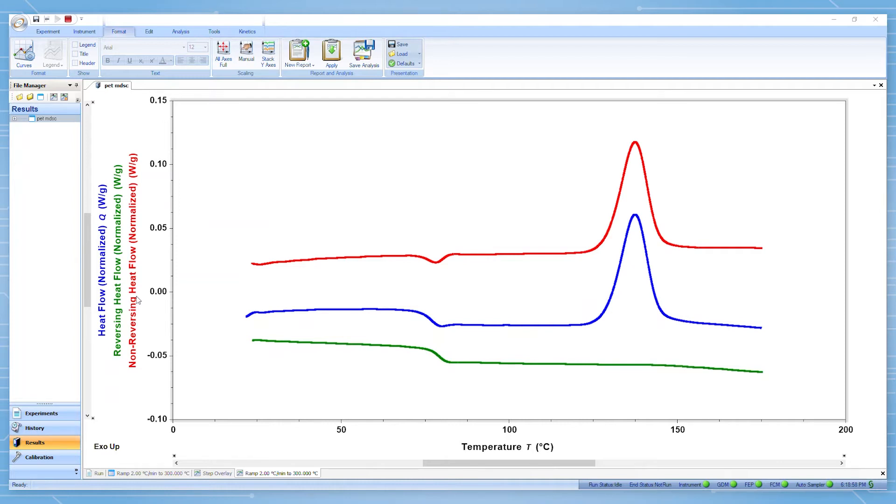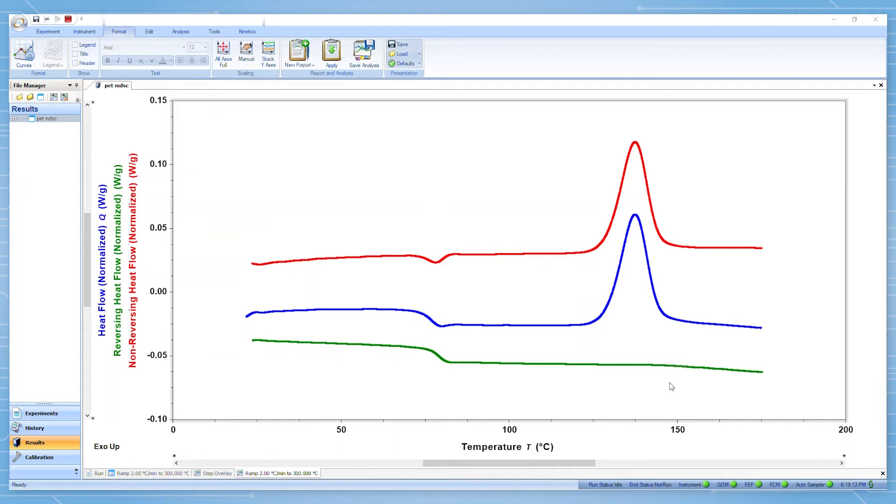Here we have an example of heat flow data from an MDSC experiment. Reversing heat capacity is the quantitative heat capacity which is determined from MDSC. This signal doesn't include kinetic events such as this crystallization.